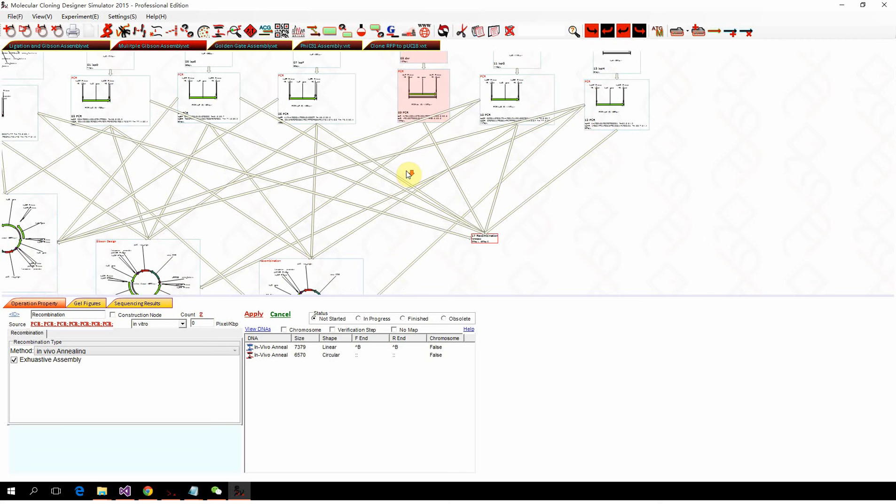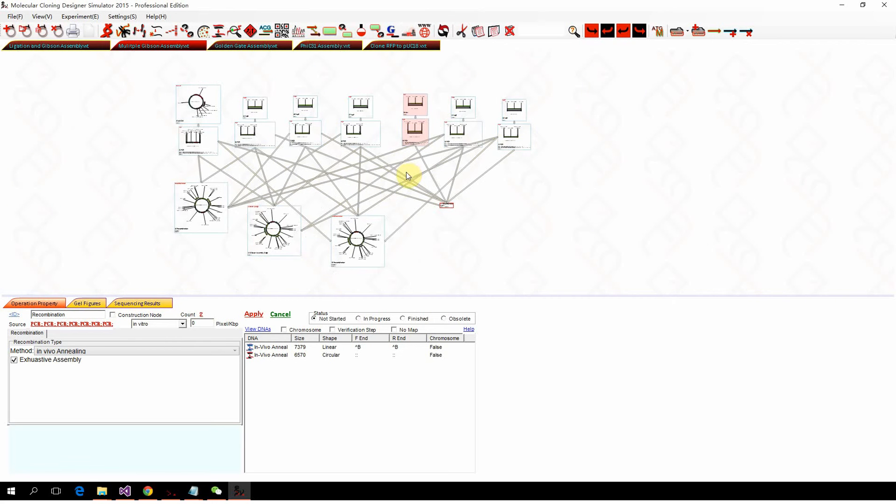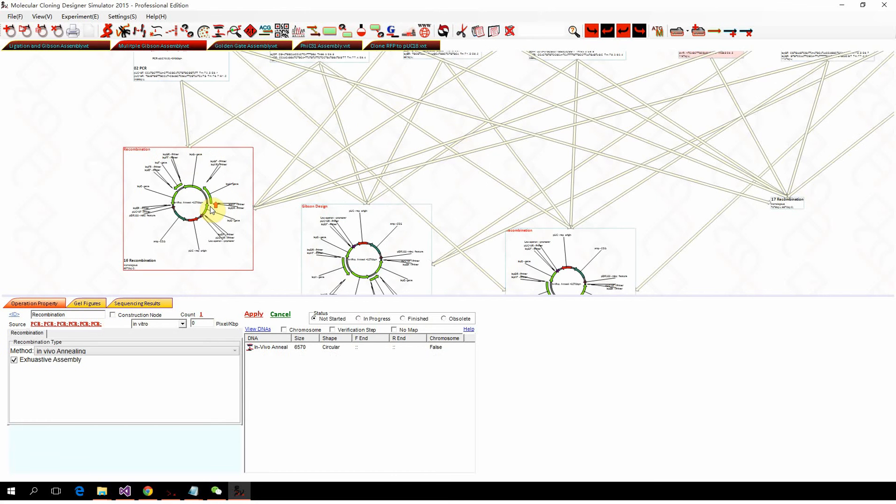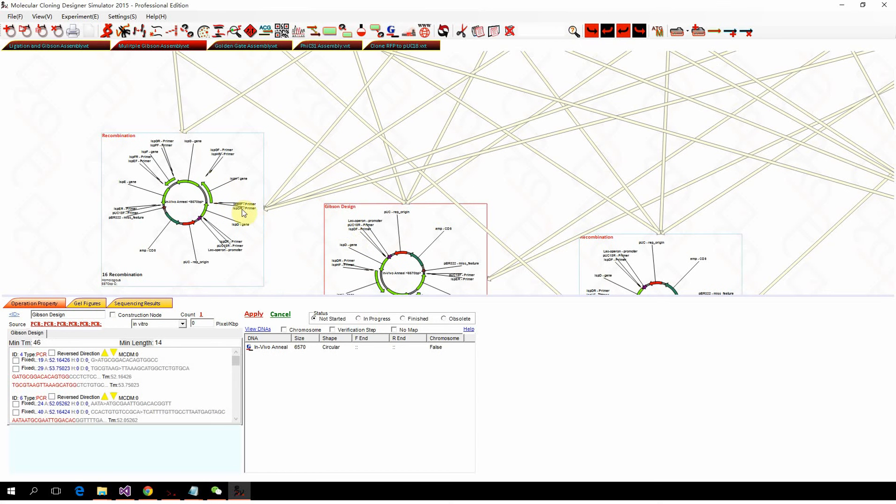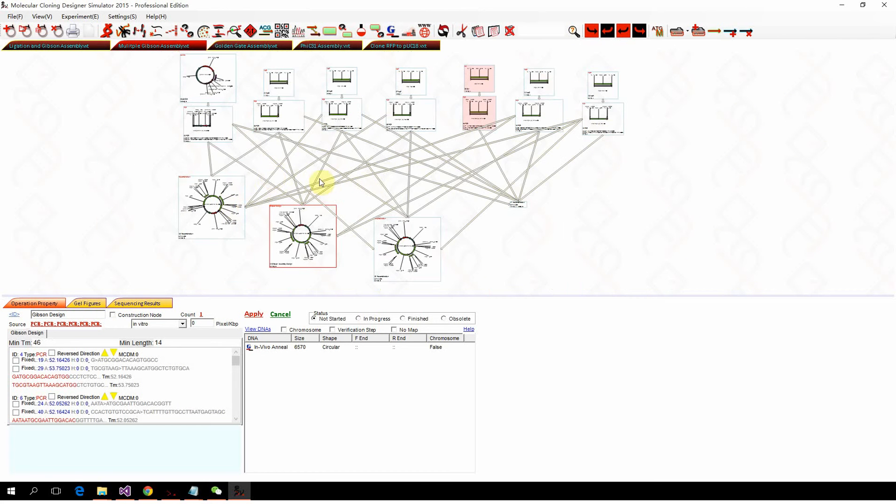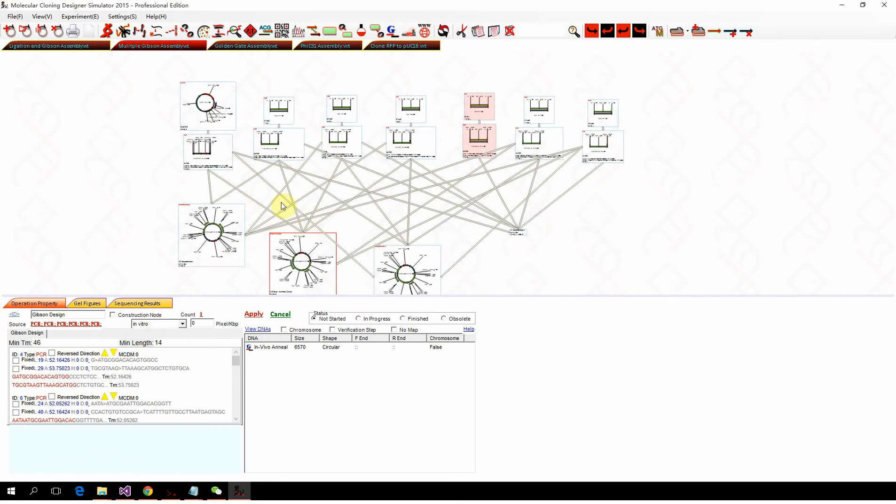That means there's something wrong in the design. This is showing how recombination and Gibson design can do the proof of your design, can simulate your design.